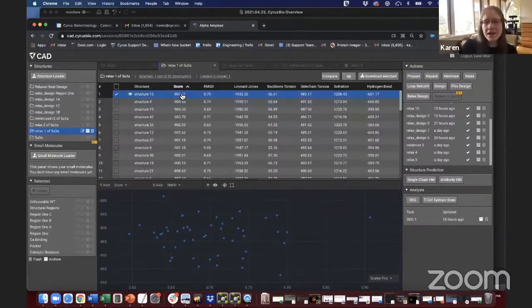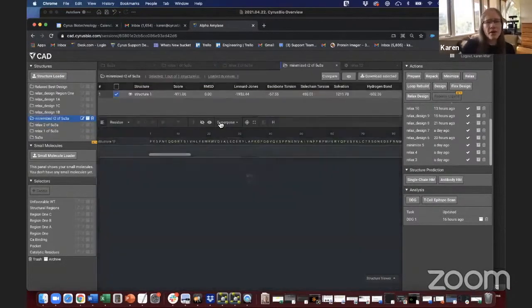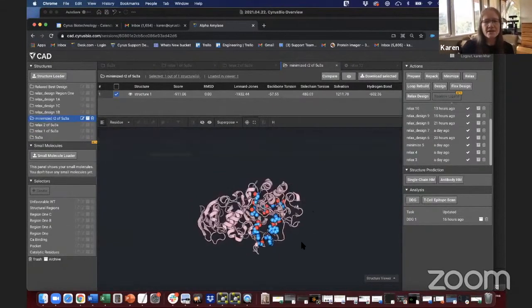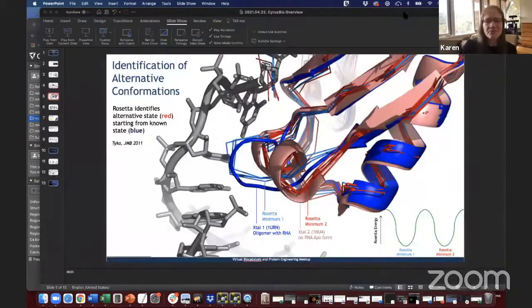So I just wanted to see if I can get some further improvement. So I ran another round of relax using this best structure as the input structure. So I think I ran 20 repeats on this one. So I didn't think I needed a lot of trajectories, and we just got about 4 Rosetta energy units improvement. So I just moved that final structure to its own little folder, so we can see that this is the best structure energetically, and that's a good starting point for running design.